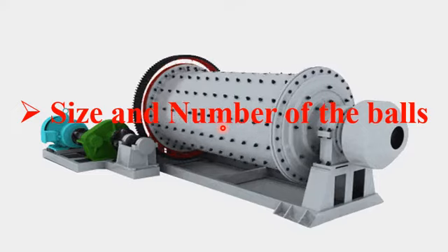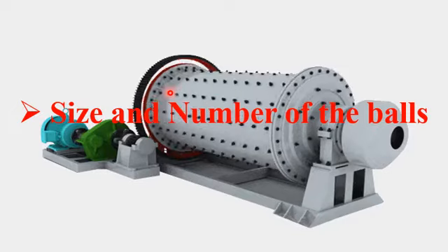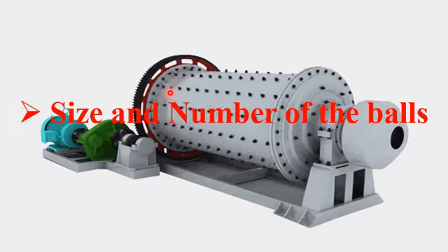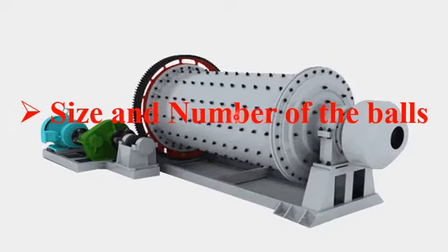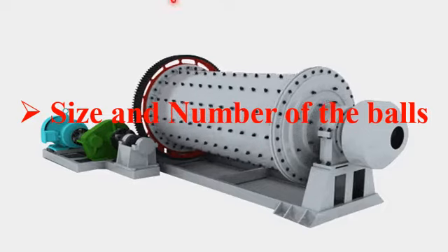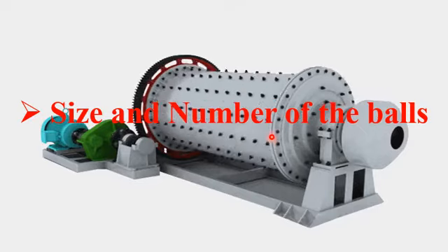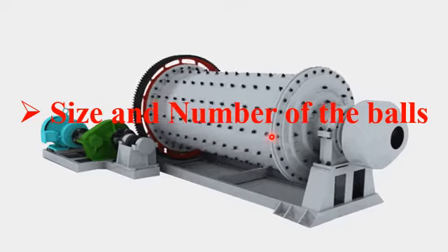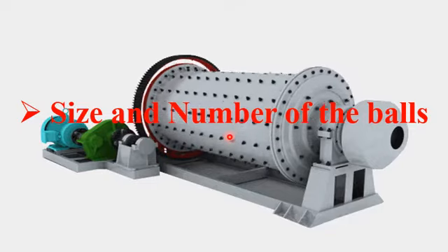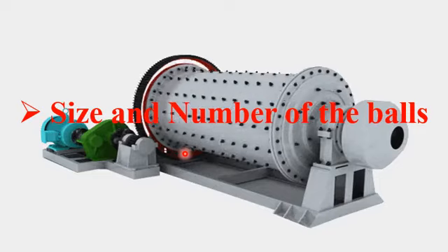So dear student, please note that the number of balls used in the ball milling process also plays a vital role. Usually the volume percent of the balls depends on the size of the chamber of the ball mill apparatus.